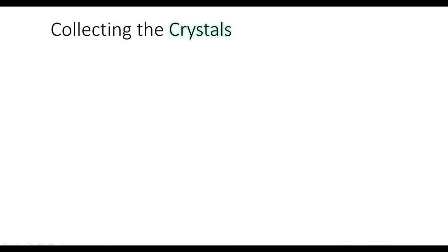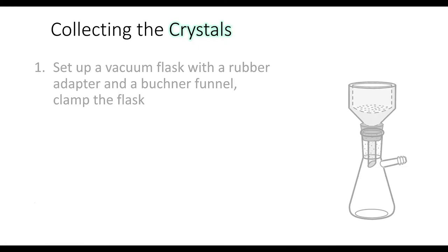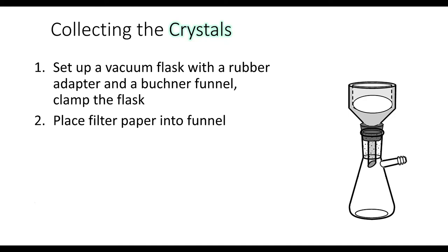Now it's time to collect the crystals. To do that, we set up a vacuum flask with a rubber adapter and a Buchner funnel on top, and we clamp the whole thing to make sure the flask doesn't fall over. Then we place a filter paper into the Buchner funnel and connect the flask to the vacuum.